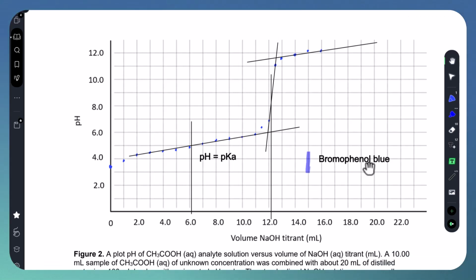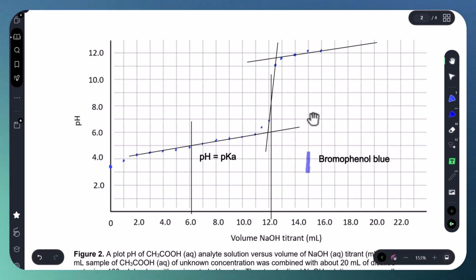When you show the pH range for the other indicators, though, you may find that they align better with this drastic change in pH, and you may come to the conclusion that they are adequate for monitoring a weak acid, strong base titration.